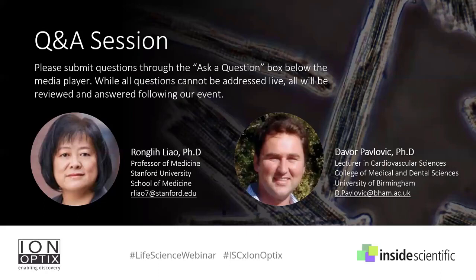Fantastic. And Rongli, what's the success rate like in your experience? In our experience, which has involved a large number of fellows and research assistants whom we have trained in the past, once you get good at it, on average, I think greater than 85% of the cells should be viable and high quality for any subsequent experiments.